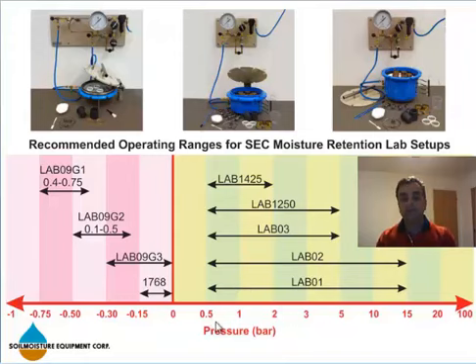Now, as you can see, I keep saying 0 to 5 and 0 to 15, but the arrow shows half bar to 15 bar and half bar to 5 bar. The reason is, as I said, we recommend that you do not use a pressure method for pressure applications under 3/4 of a bar, or here I just put half bar.